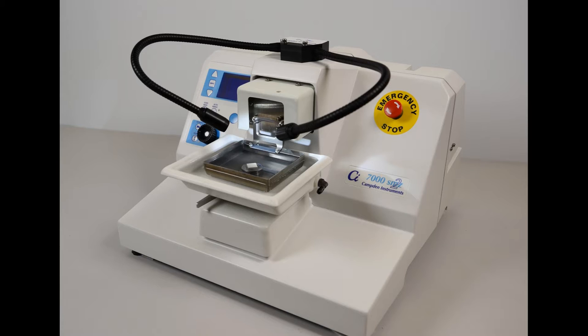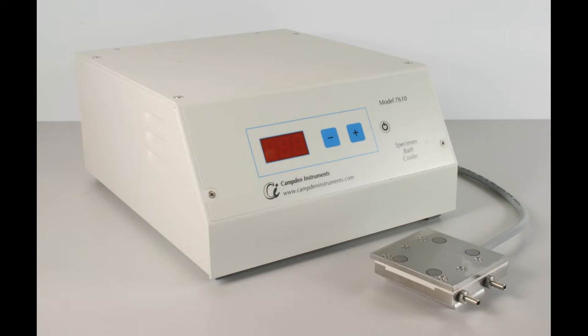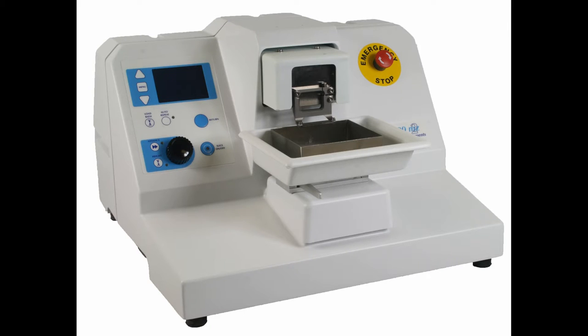A complete specification is available from Camden Instruments or our website. Numerous optional extras to facilitate slice production are available. These will be discussed later. In this video we will take a brief look at various aspects of the slicer and demonstrate its use. More explicit details regarding each aspect together with step-by-step instructions are contained in the operator's manual supplied with the instrument.